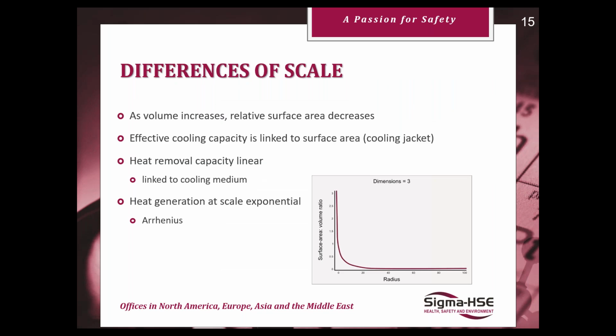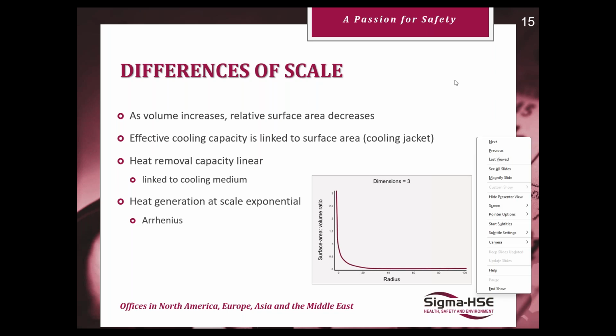As I've been harping on a little bit with the differences of scale, how it changes from small scale reactions to large: as volume increases, the relative surface area decreases. It's unavoidable.